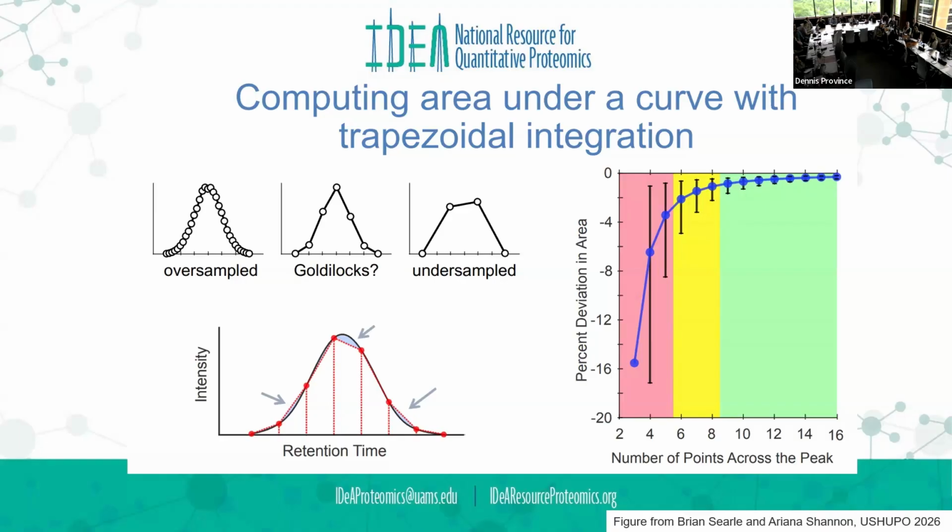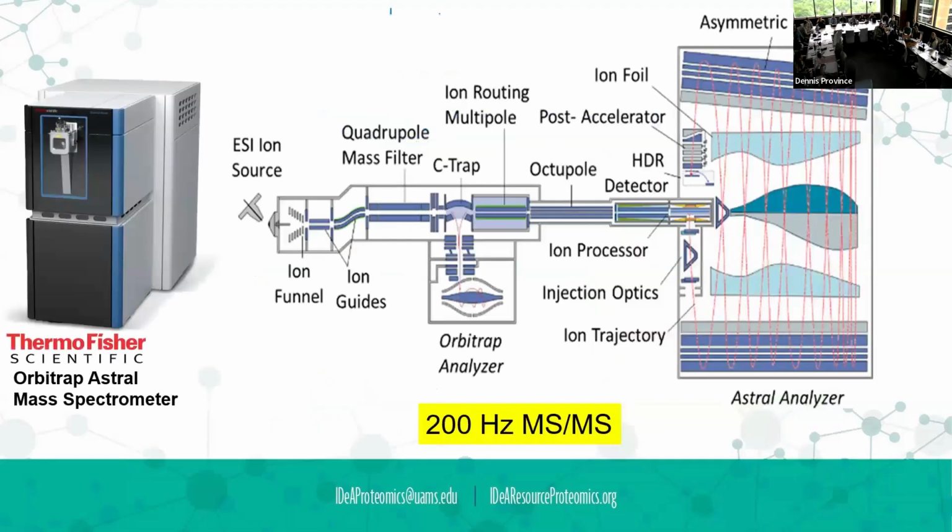The guy that we worked with for years from OMRF, Mike Kinter, is a targeting guy. He was much more comfortable with 15 to 20 points across the peak. So we always had this running joke, because when Rick comes in this afternoon, he's going to say 5 is fine. Anyway, that kind of tells you, but this is the guy that helps us with the DIA.